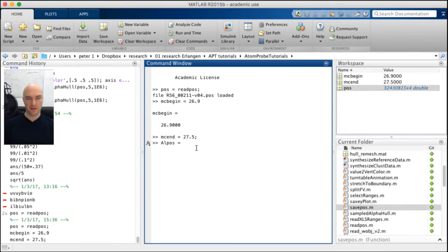Okay, so in order to get the aluminium positions, we now need to get all of the entries from here, and that's of course not all of the aluminium, because the aluminium can be aluminium plus, aluminium 2 plus, and aluminium 3 plus. But for now, for simplicity, we're just gonna get one range. So what we need now is all the entries out of the POS file. So we're going by columns now.